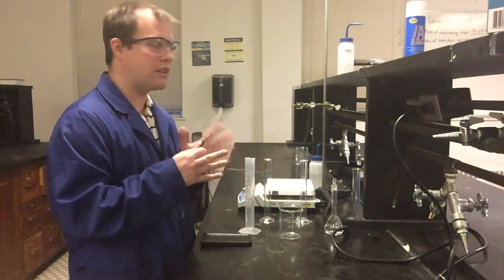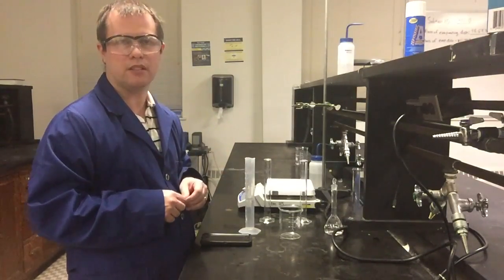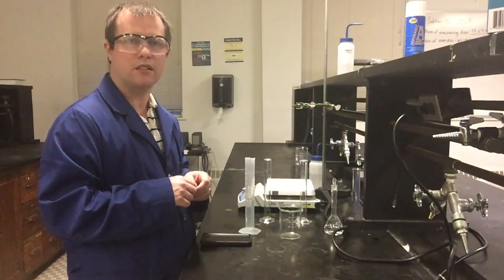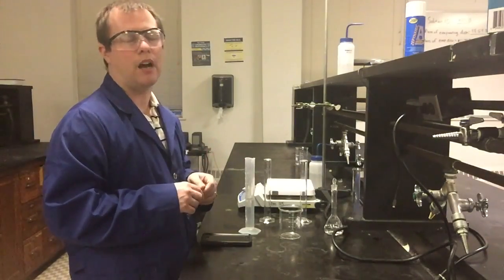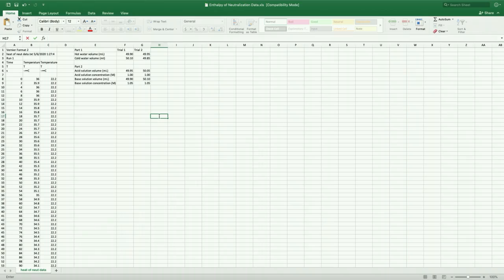But besides that, I think that covers everything from the experimental side. So I'm going to show one more clip here. You'll see the next clip of this that'll talk a little bit more about the data. I'll show you the Excel file that you guys will all see posted in your D2L, and then give you a little bit of information as far as how to get started in some of the calculations.